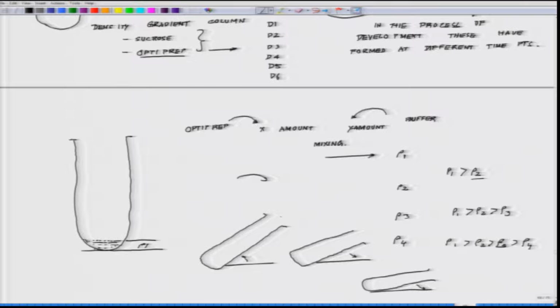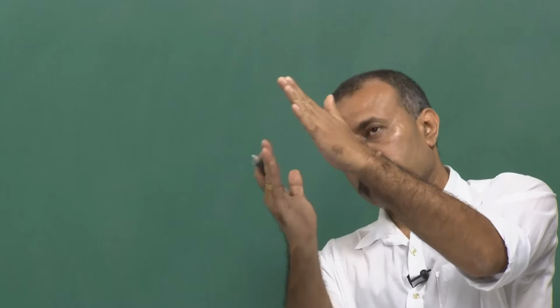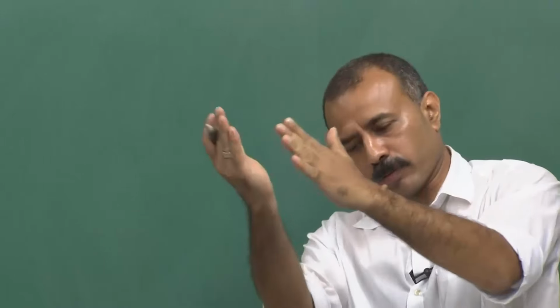And using a very narrow bore pipette, you very gently allow the stuff to form that layer, something like this. So, this is where your pipette tip is. You can further go down if you have that margin, and slowly you layer it. What you achieve is layer 1, and you have to always keep it tilted, slowly allow it to settle down, then put the next layer.